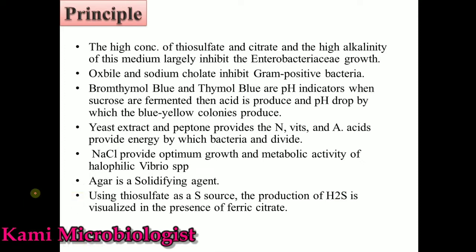Let's talk about that. As we said, this media contains thiosulfate as well as citrate, and this media has a high alkalinity property. Because of this, a lot of the Enterobacteriaceae family may not grow on this media. Now the presence of ox bile and sodium cholate inhibits the growth of gram-positive bacteria. Then we have bromothymol blue and thymol blue, which act as pH indicators. So this media also contains sucrose. So remember guys, when sucrose is fermented, acid is produced, due to which the pH drops. Once the pH drops, we get yellow colonies from blue. So this indicates sucrose fermentation and acid production.